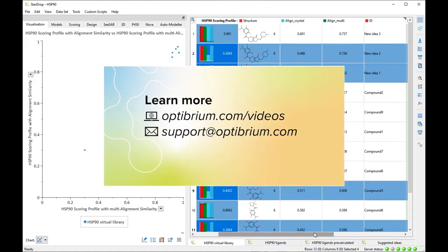StarDrop contains many more features for selecting and designing compounds, and further worked examples are available from the tutorial section of the Optibrium community.